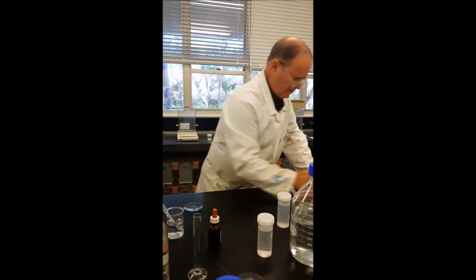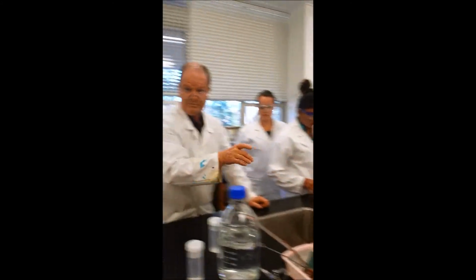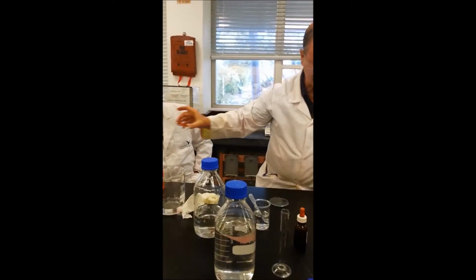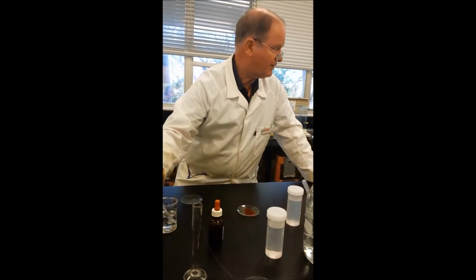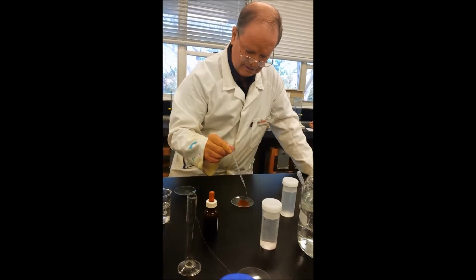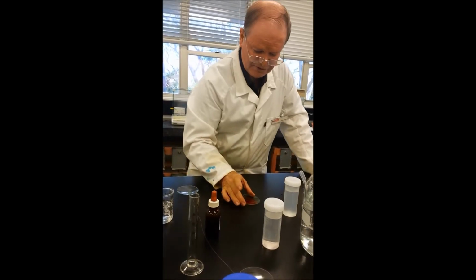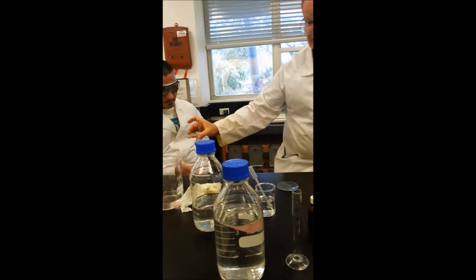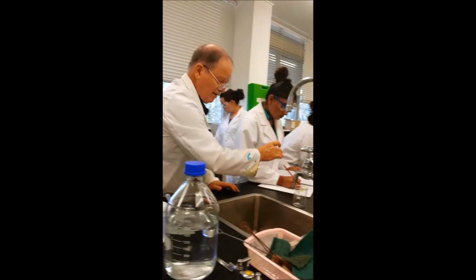Okay, goes red. Spot that? Goes red. One drop goes red. Minimum amount. HCl first. Now in service, what's going to happen is that you're going to start with an acid or alkaline, and you're going to finish with the other. So this is actually a good simulation of the use of the, see, it's gone yellow. So in acid it was red and it was yellow in the other one.